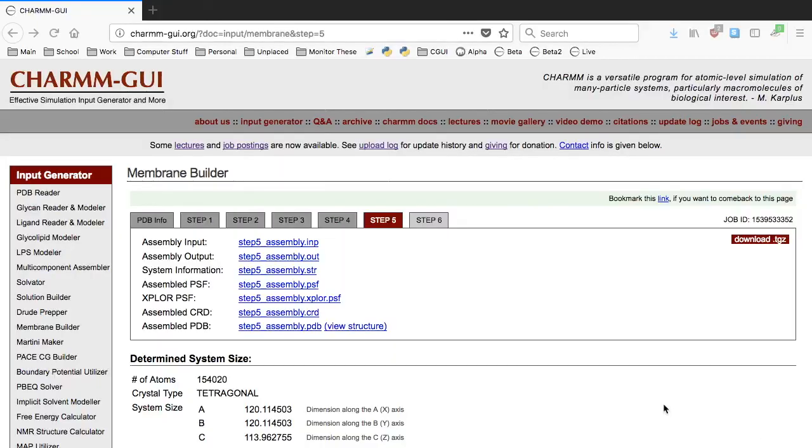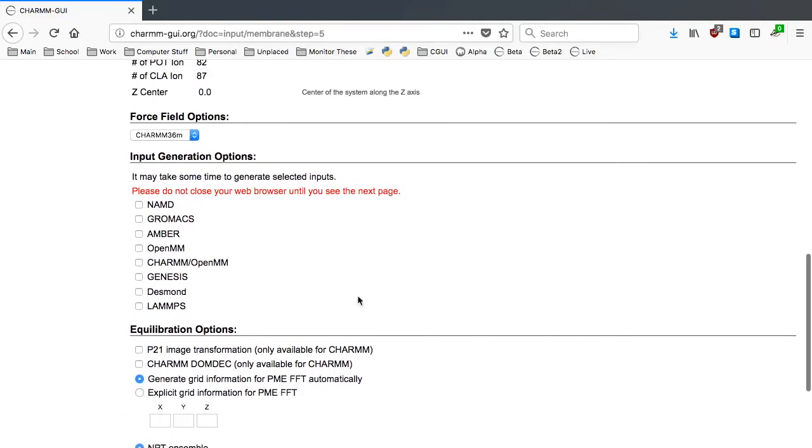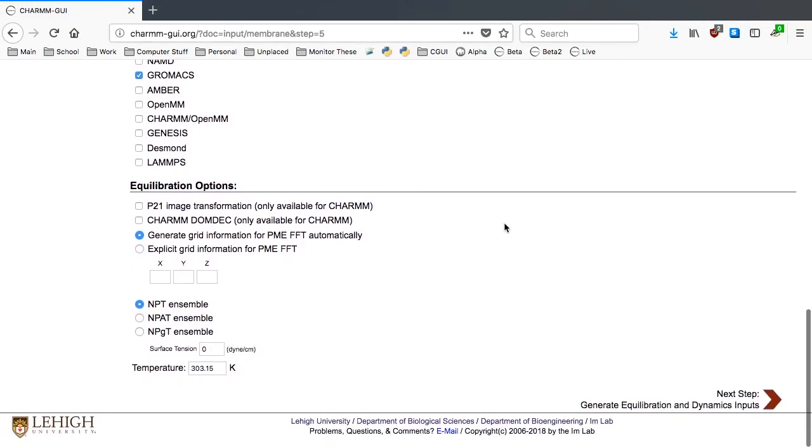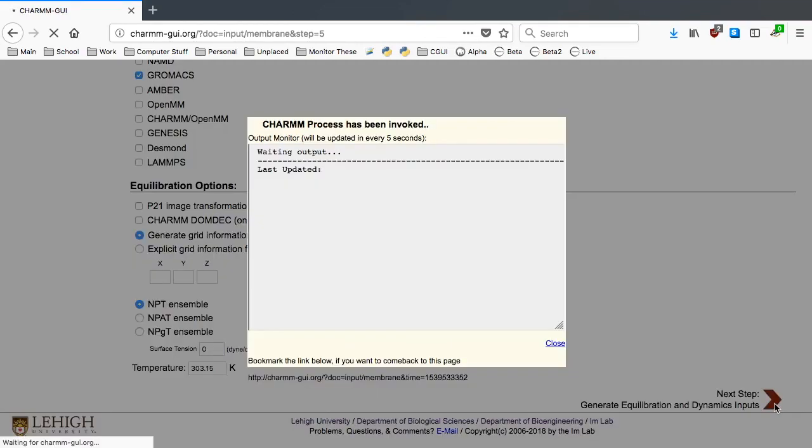If you're interested in running your simulation using GROMACS, you can select it. Otherwise, we don't need to change any other options, so we can click Next Step to finalize the system building and input generation.